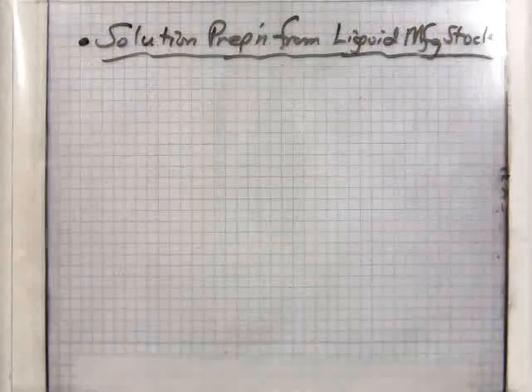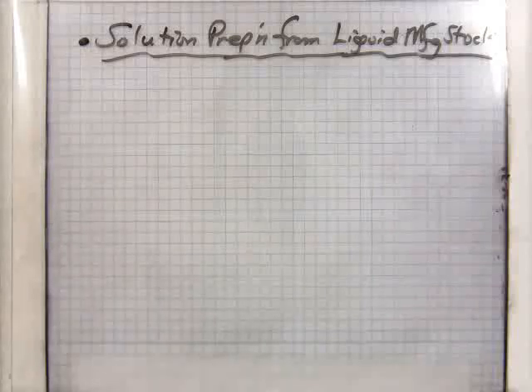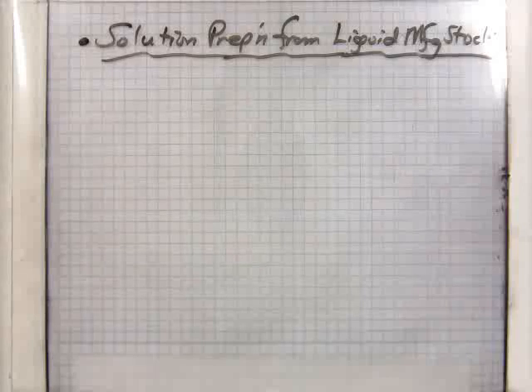The formula that you use provides you with a volume number, because you started a minute ago with a mass number, so you need grams to extract. Well, in this case, how many milliliters do I need to transfer into the mixing container and dilute up to, but not to exceed, the needed volume? Well, the formula looks exactly the same as the first mass number, except it's divided by a density number. Well, it's actually specific gravity.